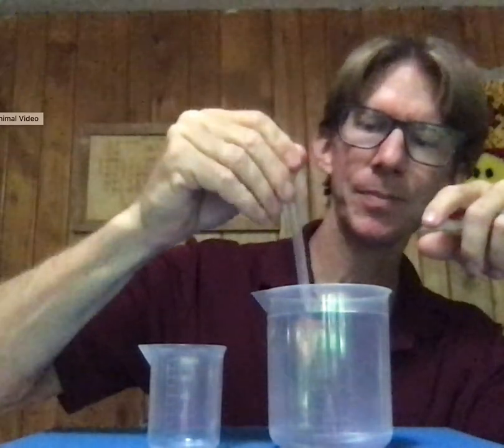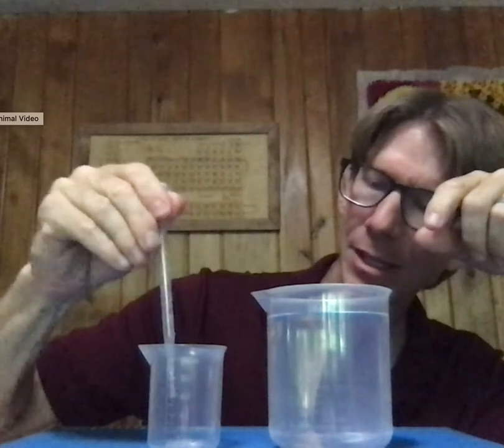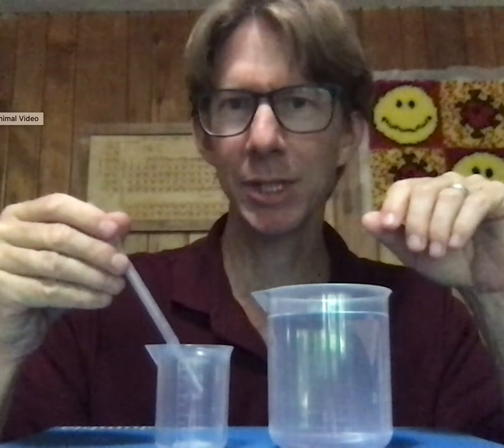Let's give it a shot. Squeeze, fill to 2.0. The shape of my meniscus is convex. I'm sucking it up to exactly 2.0. The shape changes when I start pushing out, but it's still at 2.00. Deliver my 2.00. Squeeze it a couple times to make sure you've got it all out. Touch it to the inside to make sure you've got that last drop that might be hanging onto the tip. You have now delivered 2.0 milliliters using the pipette.